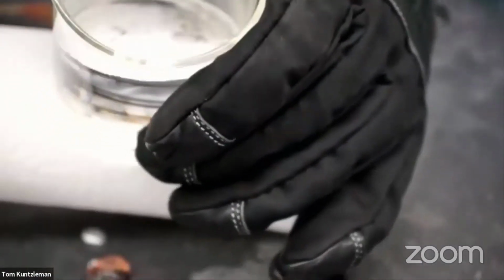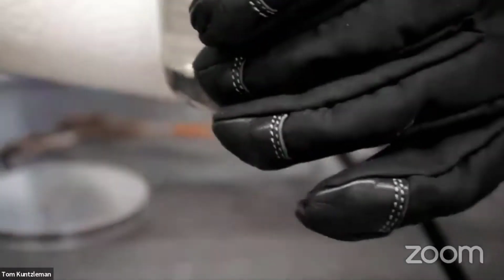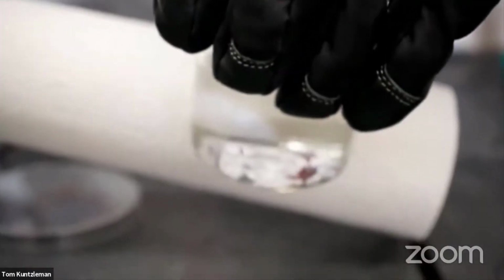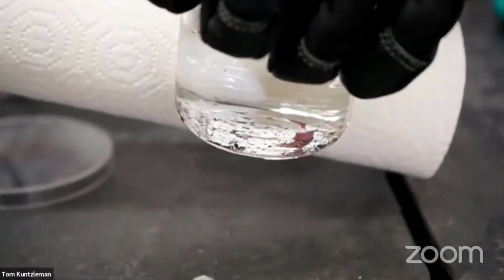Shine it here. You can see it there. Oh yeah, there we can see them. Now we can see the flecks, the flecks of the black copper oxide. Yeah. So there's some differences between new pennies and, well, old pennies. Quite a bit of difference, actually. We expect that, of course.